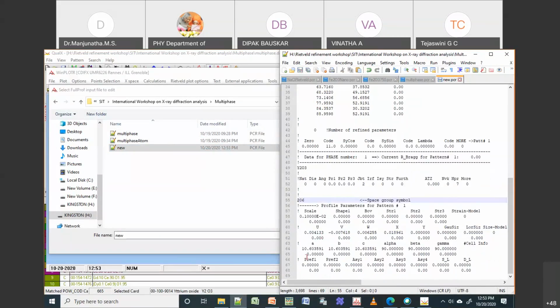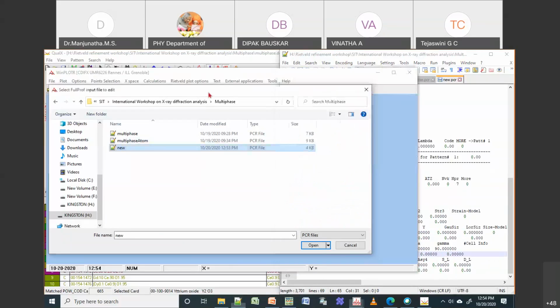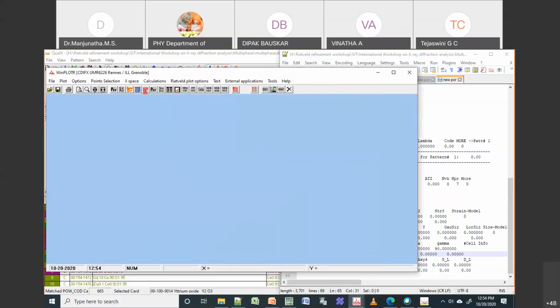Then I will ask the program to run 0, and also I will ask the program to run the ABC. So this is 1, then this is 2. A is equal to B is equal to C, so it is 21, 21, 21. If it is different, then you need to give different values. Okay, fine. So now I will just run this program.